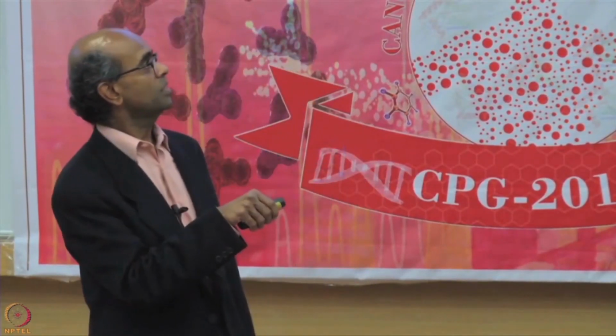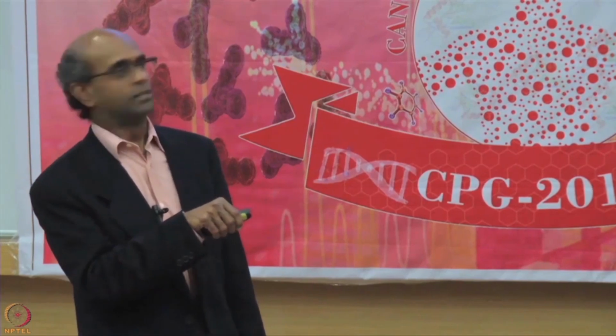One is called complete case analysis. So you throw away any data that is missing and then you do your analysis. So if a protein was observed in 95% of your samples but missing in the 5%, you throw it away and then you do your analysis. This loses a lot of data. And in phosphoproteomics, this may not be a good thing because you will lose a lot of your signaling peptides. You may lose a lot of your biomarkers too, even in the proteomics data. So you want some other method.